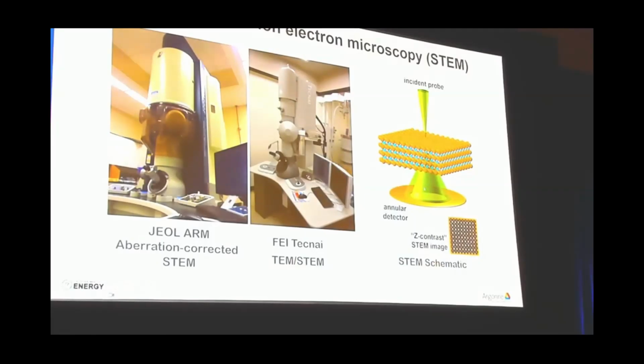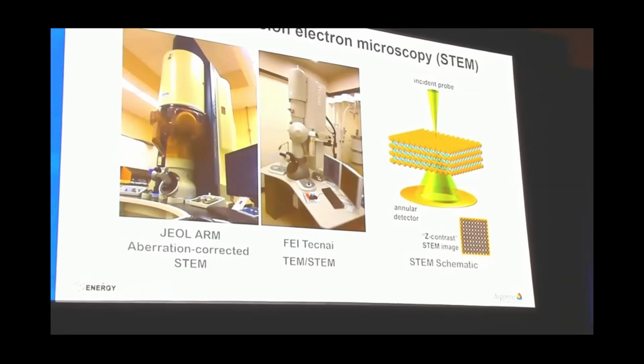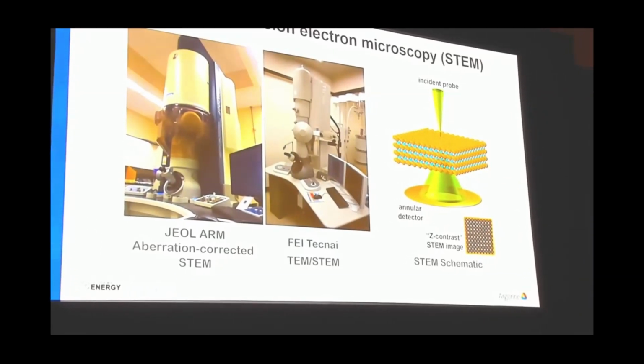So let's go ahead and start with tomography. You've been looking at STEM images all morning, and you may or may not know the difference, but STEM is scanning transmission electron microscopy, different from standard TEM in that you focus the probe and scan it across the specimen surface. You can see my arrow there. And the reason why this is important for catalysis is because this image gives you its scattering. The electrons are detected on this high angle detector here.